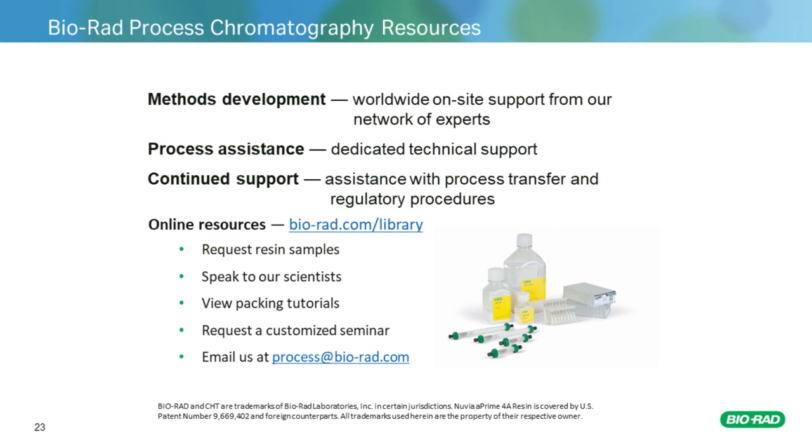But for most of the mixed-mode resins, like those with hydrophobic character, you can actually have your buffer with a modest concentration of salt and still have good binding capacity and selectivity. This often can simplify the step transition between your different purification methods without a lot of sample manipulation.